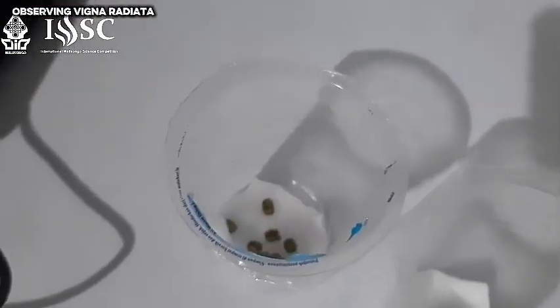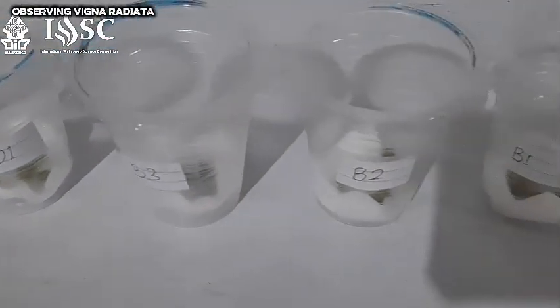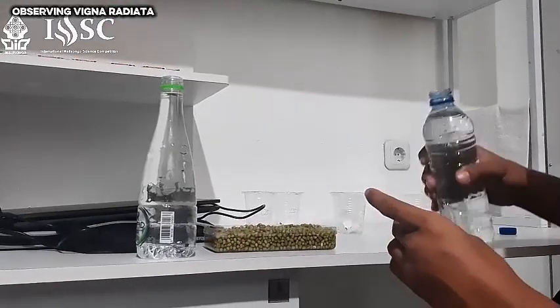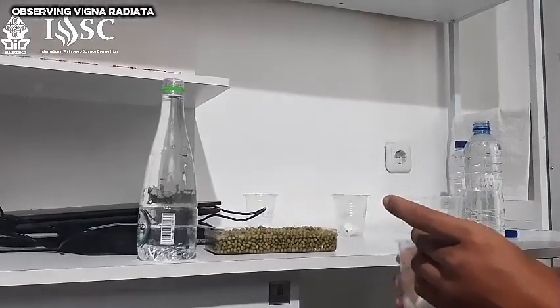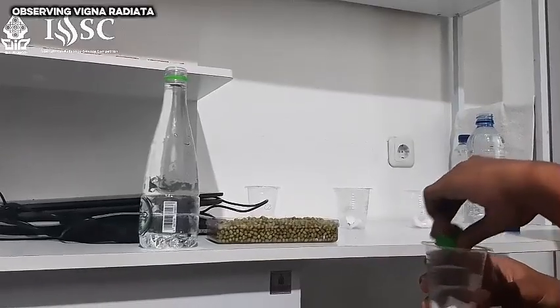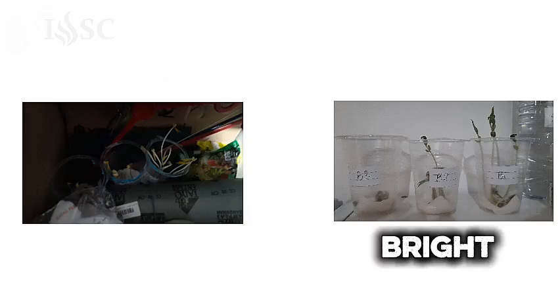Here are the codes of the treatments: B1, B2, B3, D1, D2, and D3. And then water the cups with the suitable solution according to the codes. Use a bottle cap as a measurement. And then place cups with code B in a bright place and D cups in a dark place.